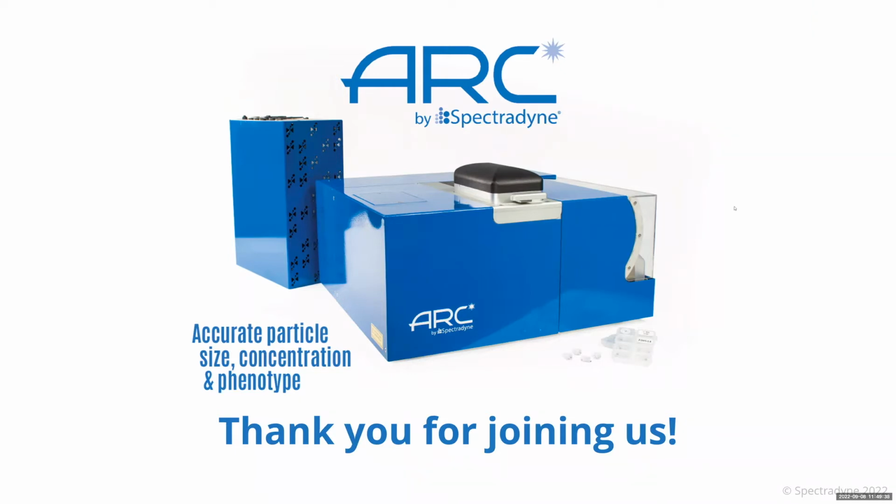One other question from Michael, or Mikhail, I'm not sure: what limitations on the sample are there? Can I inject cell-free plasma directly? Does it need dilution? If I have a particle in a buffer, would it need a surfactant added? That's several questions in one. Good question. On the NCS1, which is fundamentally the same, with microfluidic cartridges and getting the sample to flow through there, we know that we can run cell-free plasma pretty much neat.